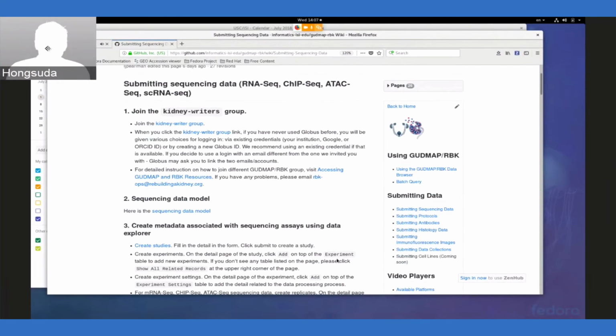Yeah, so the plan is basically that you're going to have to upload to both places. But hopefully once you upload everything to our site, when you click export, we're working on an export feature that will generate a zip file that hopefully has everything you need to submit to GEO, and formulates all the metadata that you supply in the form that GEO will take, without you having to do any more work.